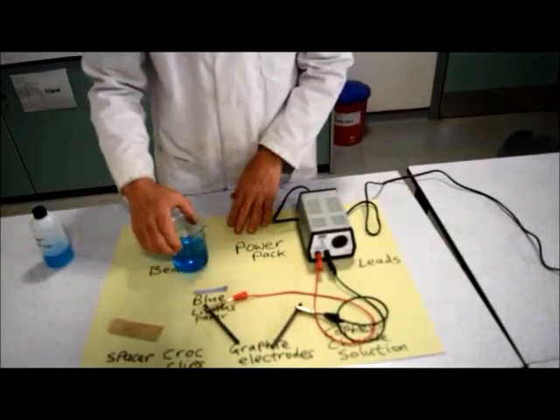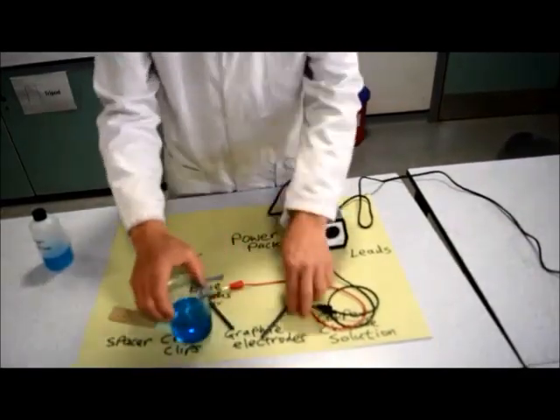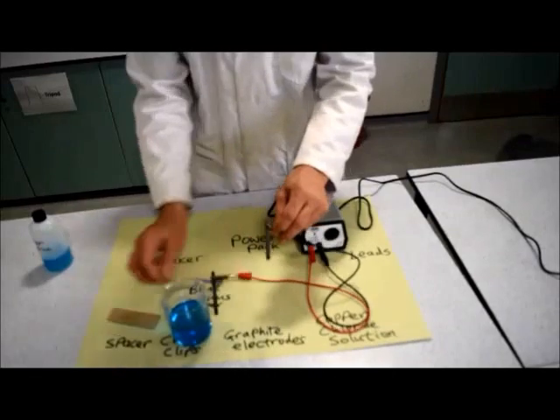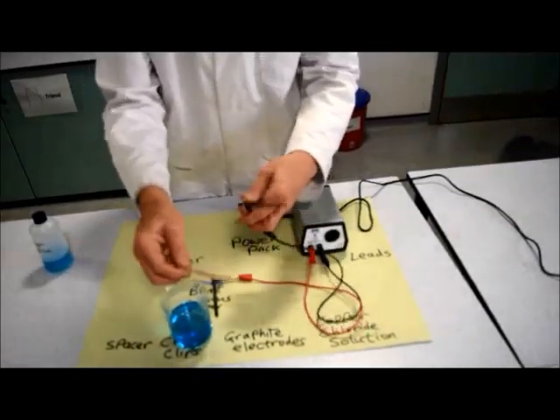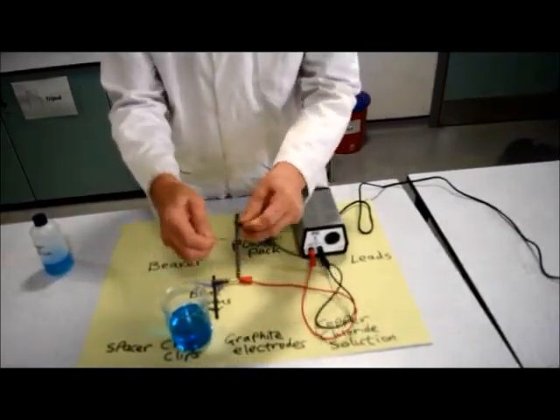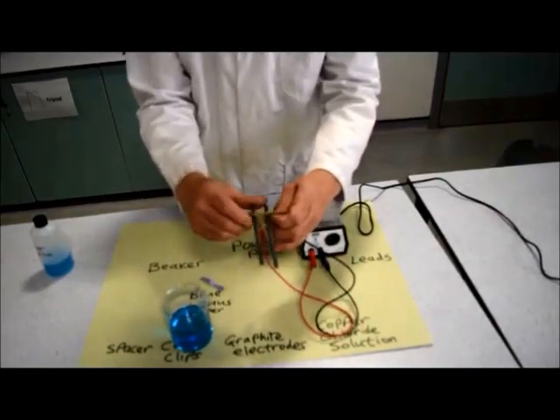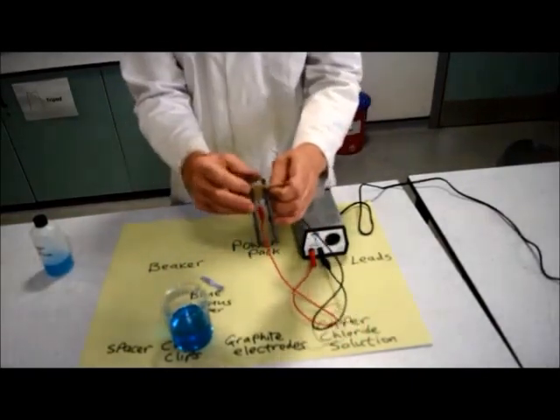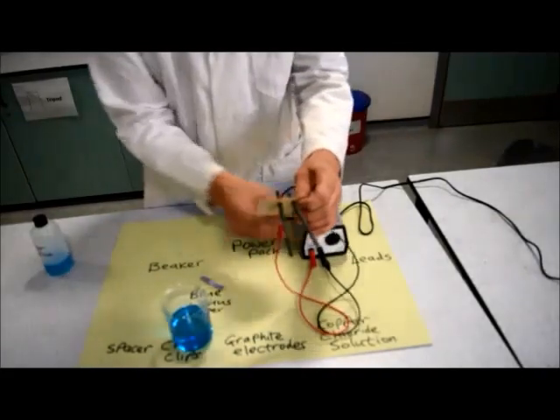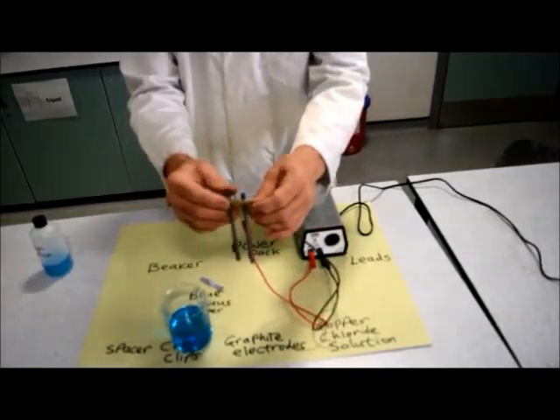It's very important that when we put this together, the electrodes don't touch. Here we've got a spacer, and we're going to insert the electrodes into the spacer so it keeps them apart. You don't want these touching when you turn the power on, otherwise you'll get a short circuit.